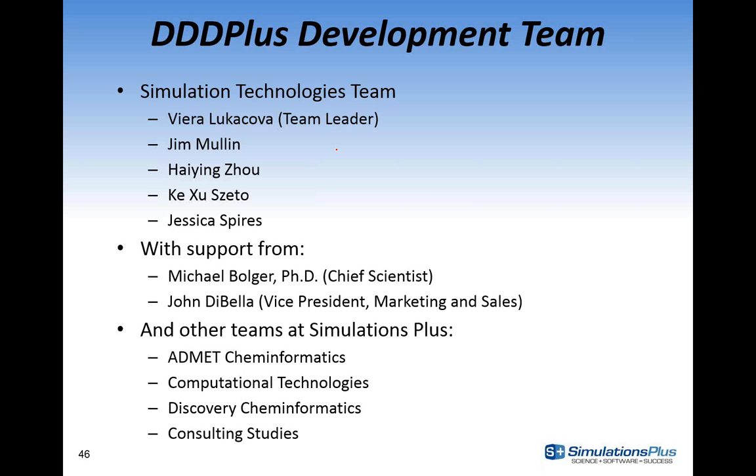Okay. Thanks a lot, Jim. That was a really insightful discussion. And I think especially with that case study that highlights the use of the two software tools together for slightly better in vitro and in vivo extrapolation of dissolution principles when we're going into GastroPlus, and then also being able to use DDDPlus to help design or optimize these formulations, and hopefully, as you mentioned, a fewer number of iterations. Now we would like to open it up to questions.